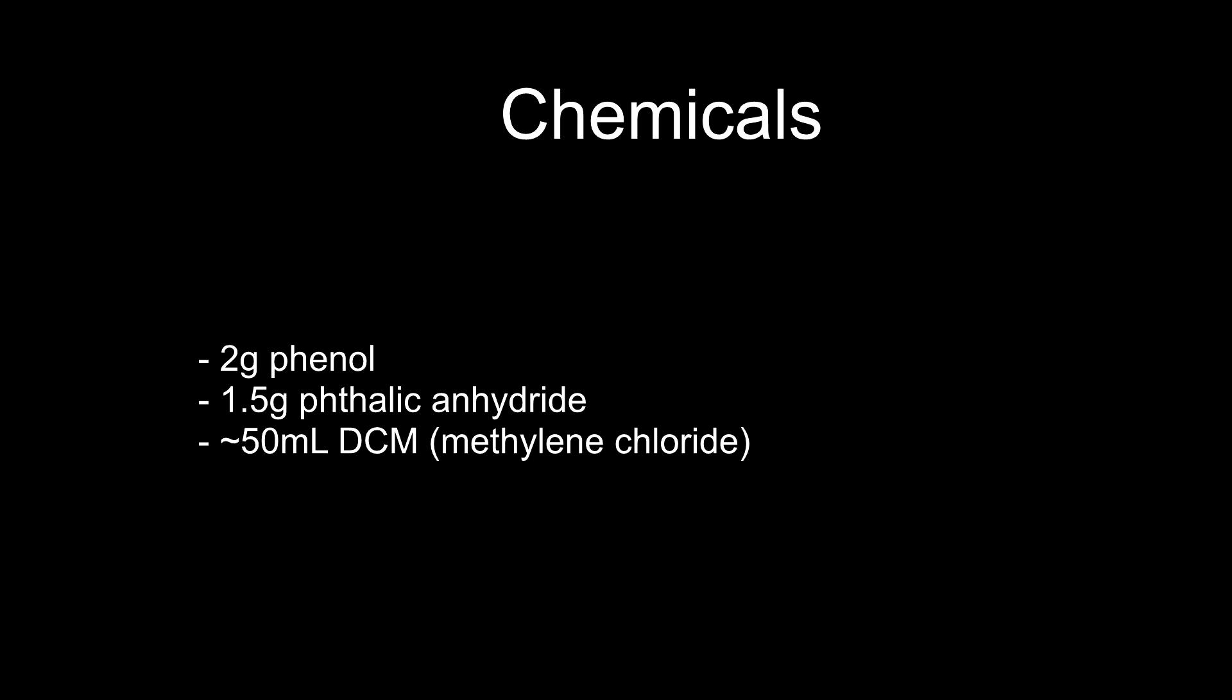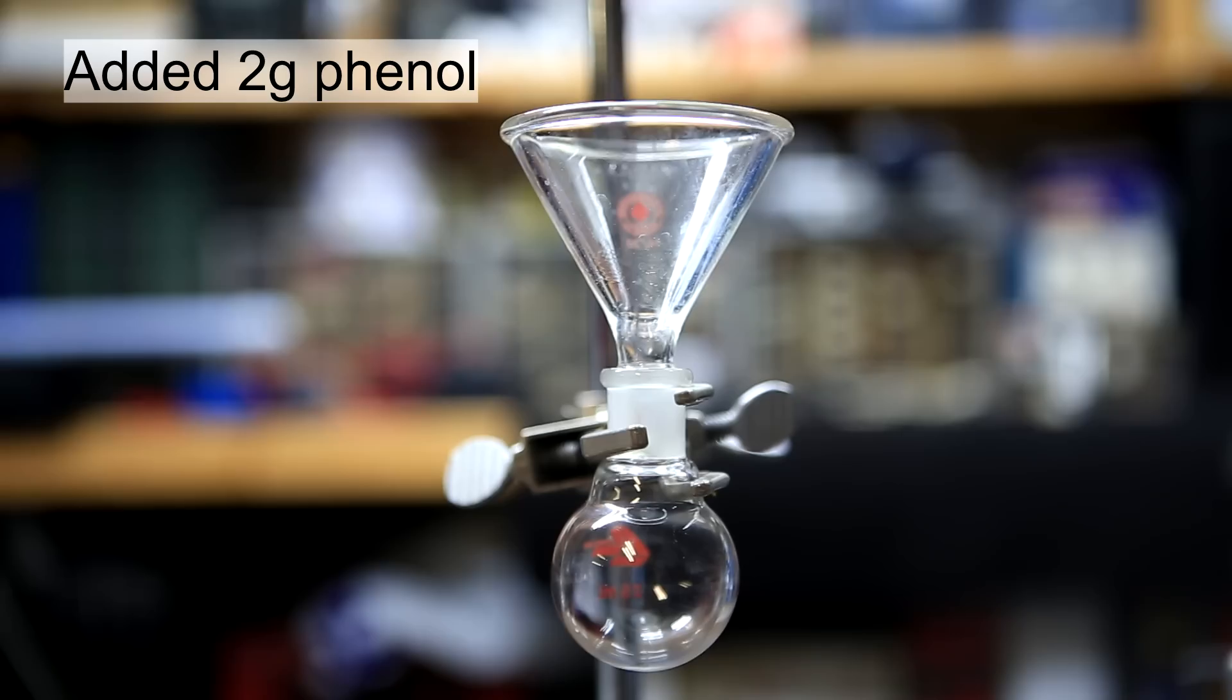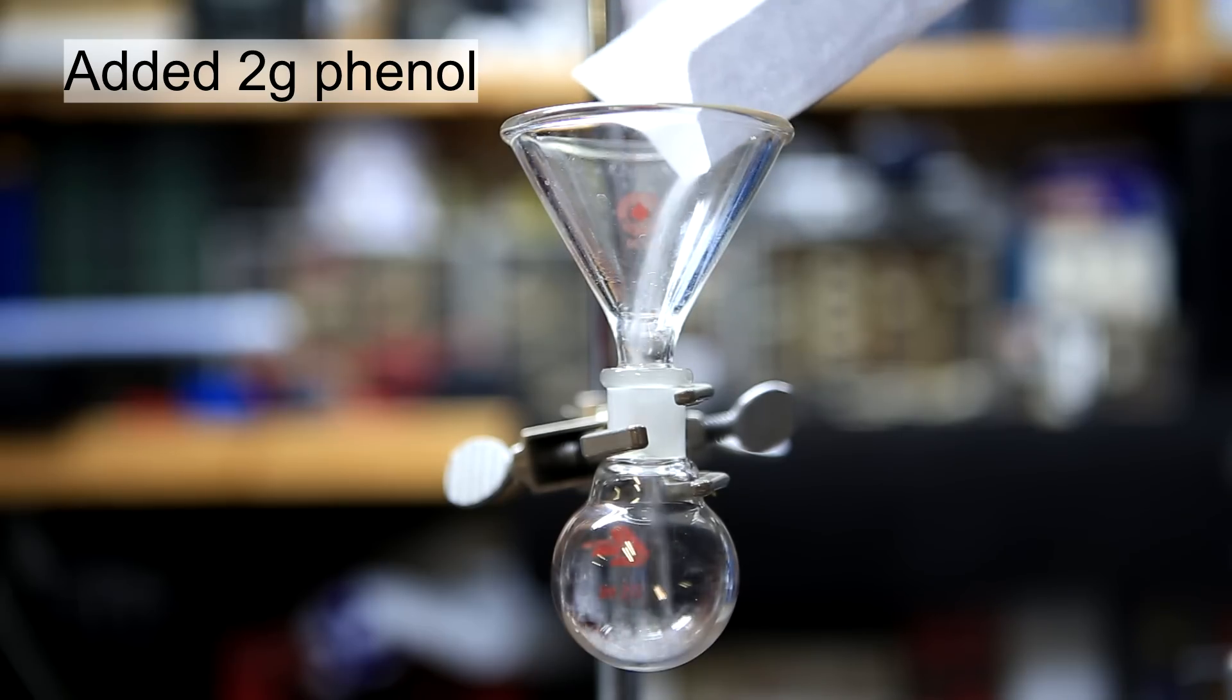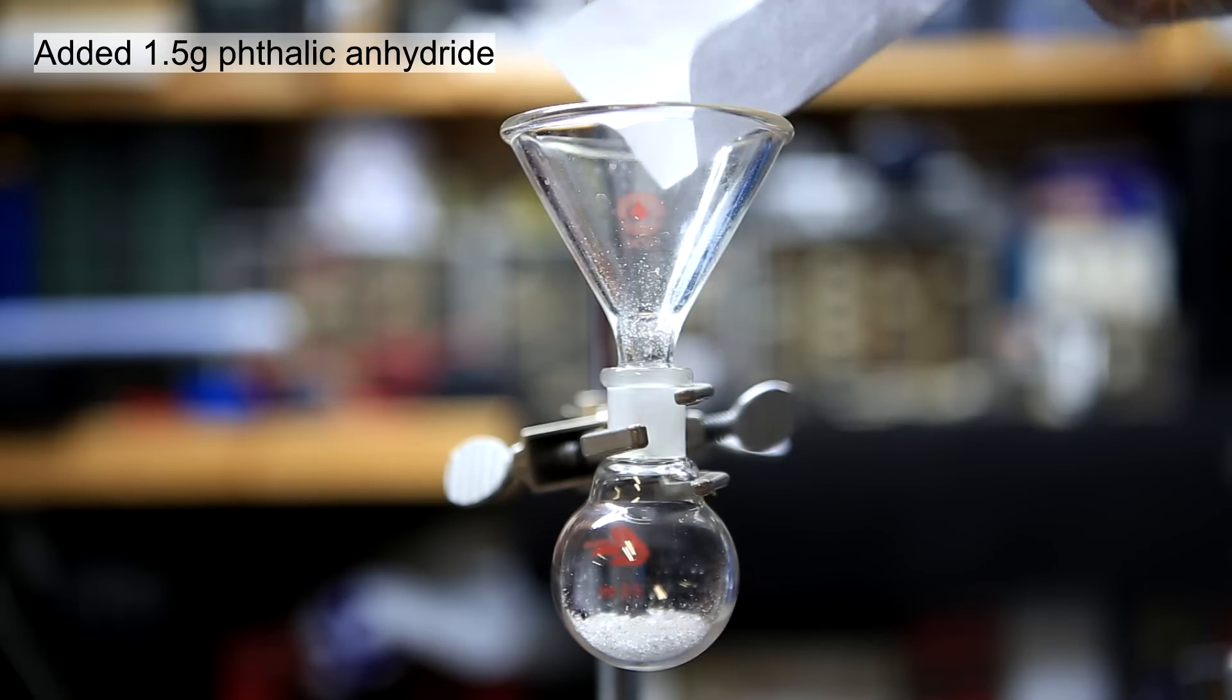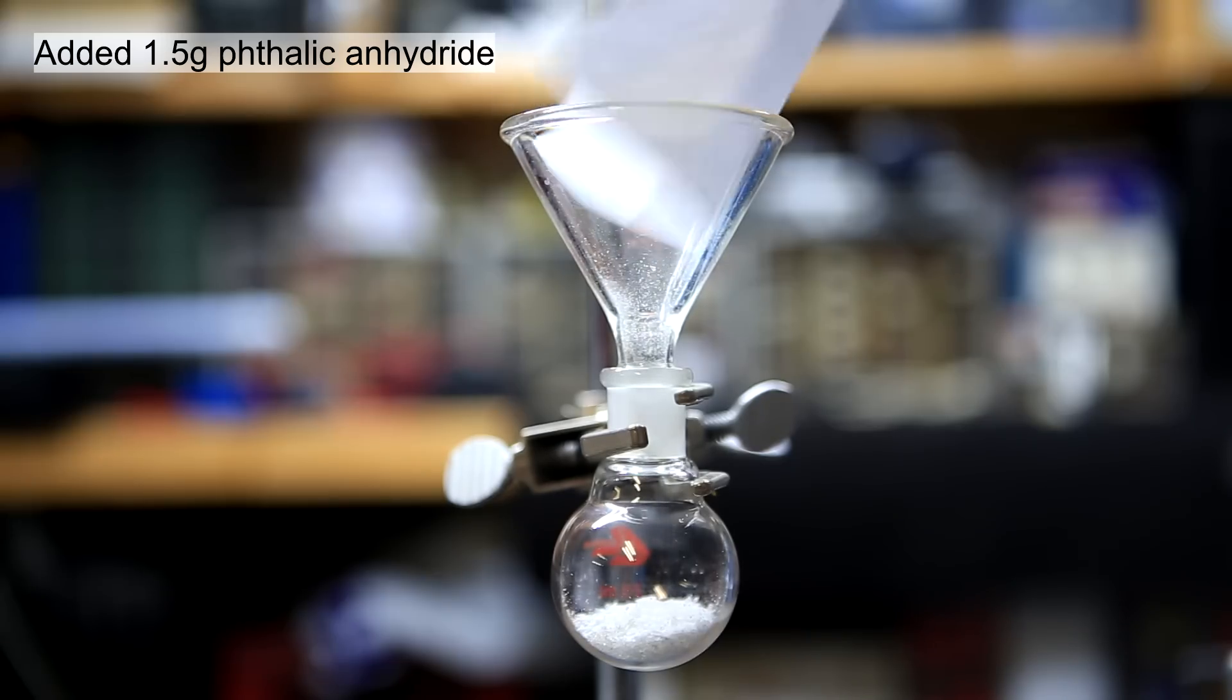As a side note, in previous videos I've shown how all three of these chemicals can be obtained from household products. 2 grams of phenol was added to a 25 ml round bottom flask. This was followed by the addition of 1.5 grams of phthalic anhydride.